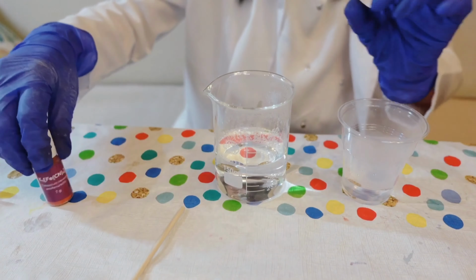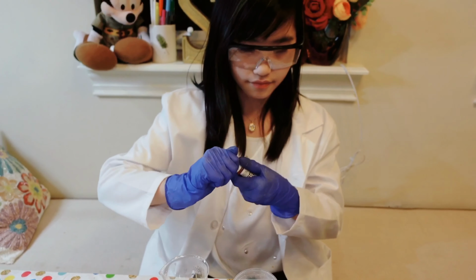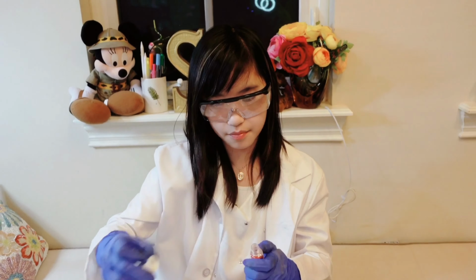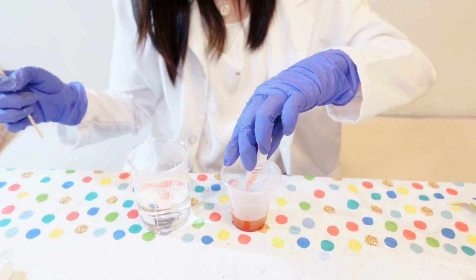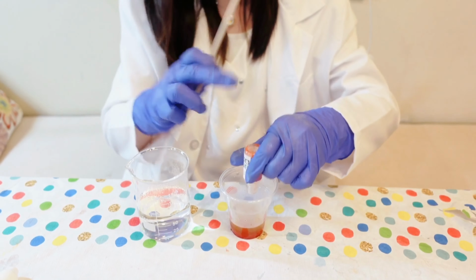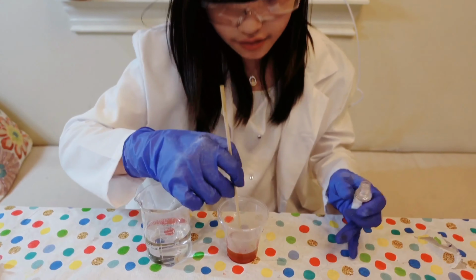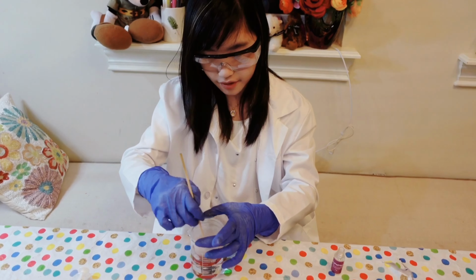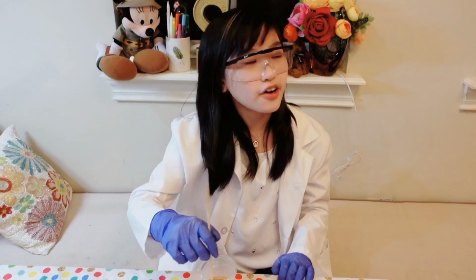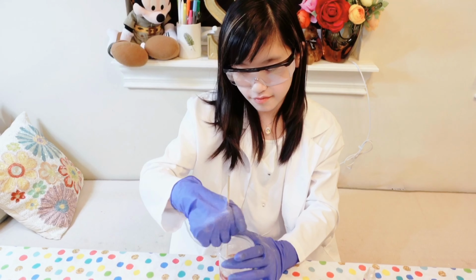Now we're going to get the potassium hexacyanoferrate and put in 1 bottle of it. Now I'm going to put this in here and I'm going to mix for 2 minutes. Okay, Google, set a timer for 2 minutes. 2 minutes, and we're starting now.